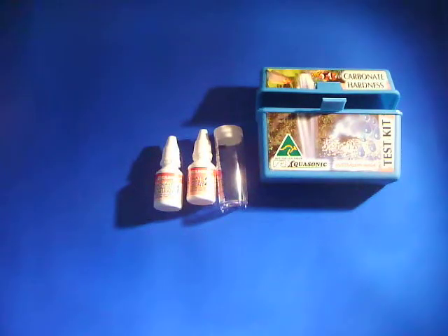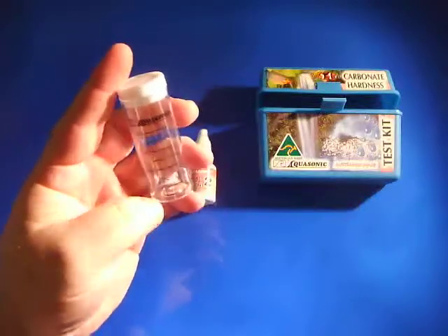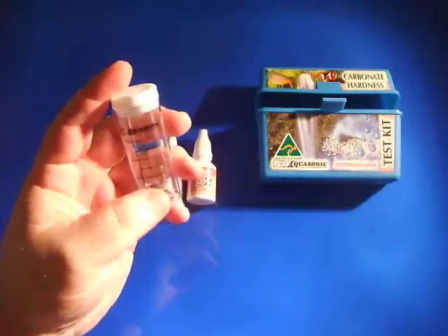All you need to do is: when you are doing it in 20 parts per million steps, you fill the vial up to the 5ml mark; if you are doing it in 10 parts per million steps, then you fill it up to the 10ml mark. So there is your 5ml mark and your 10ml mark.